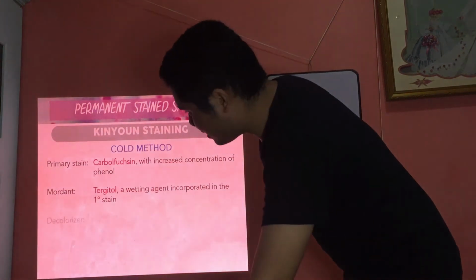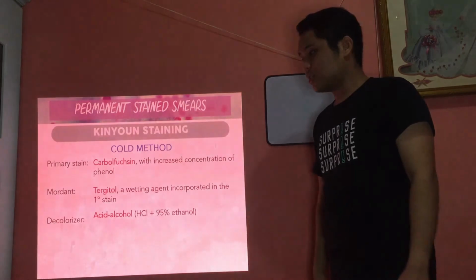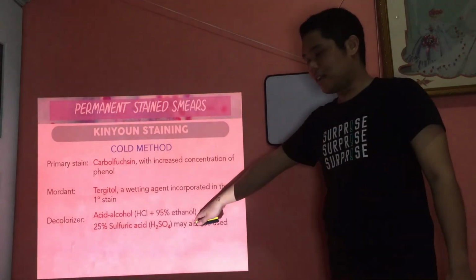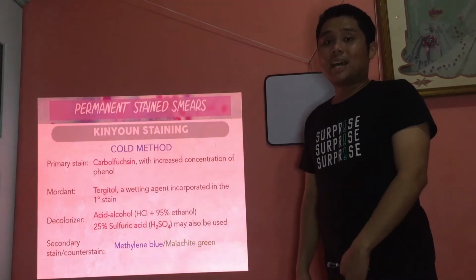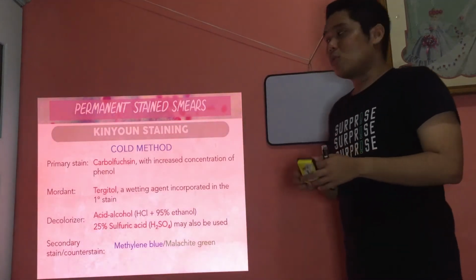And lastly, the decolorizer is still the same: acid alcohol, hydrochloric acid plus 95% ethanol, or you can use 25% sulfuric acid. The secondary stain is still the same, either methylene blue or malachite green. Now, the third procedure is auramine rhodamine.